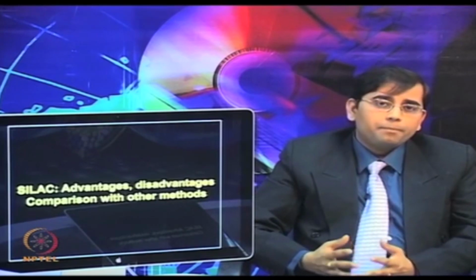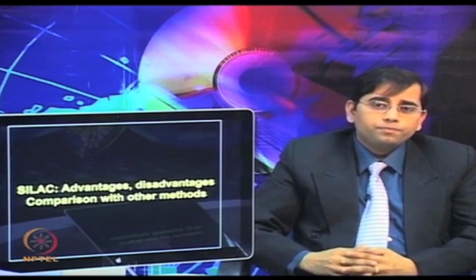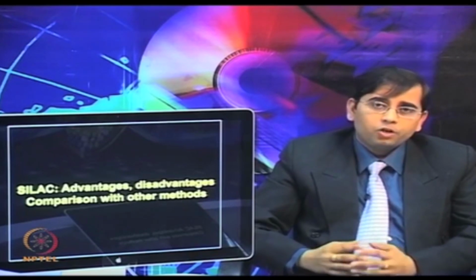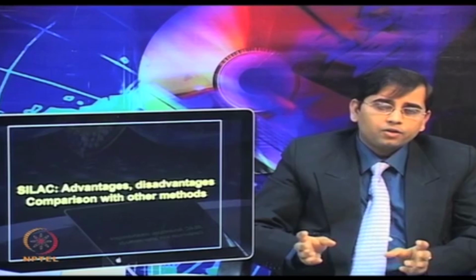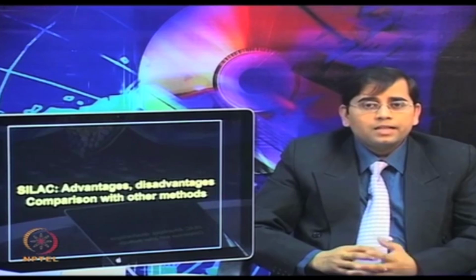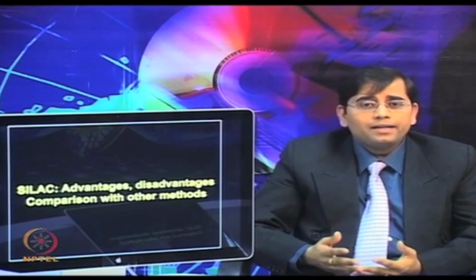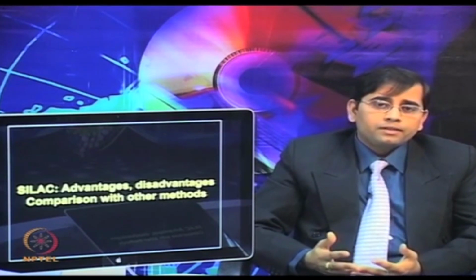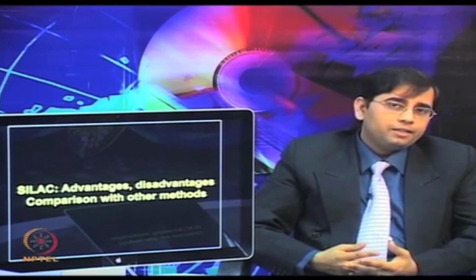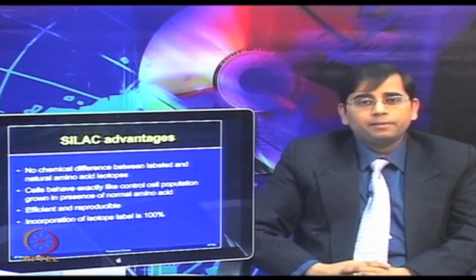The labeled samples are mixed at the stage of whole cells, which makes the SILAC approach ideally suited for quantitative proteomic experiments, because there will be less handling variation and fewer manual artifacts for each population separately. Studies such as subproteome analysis, for example of cellular organelles, or complex purification protocols can also be performed with very good quantitative accuracy using this method. So, let us discuss some of the advantages of using the SILAC method.